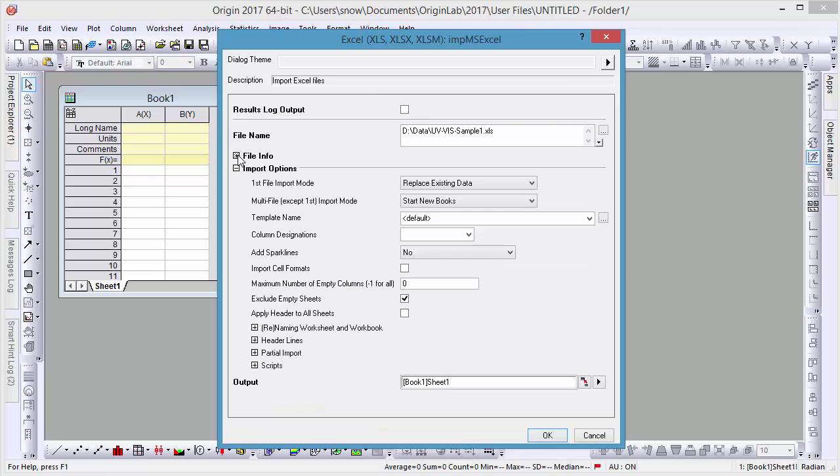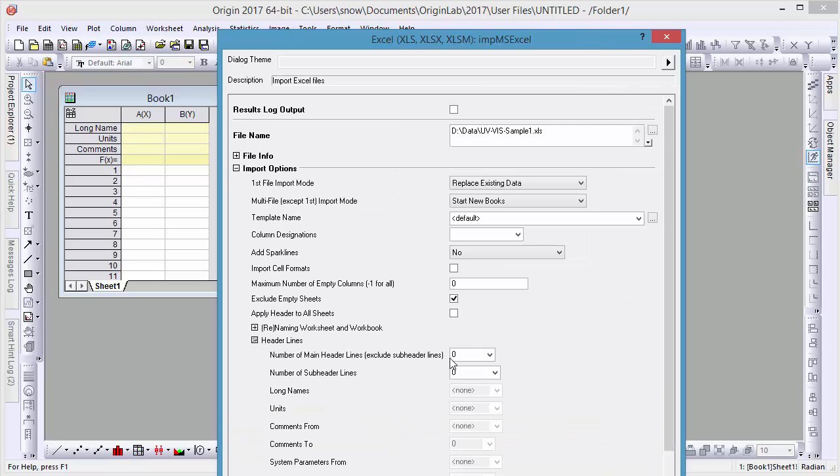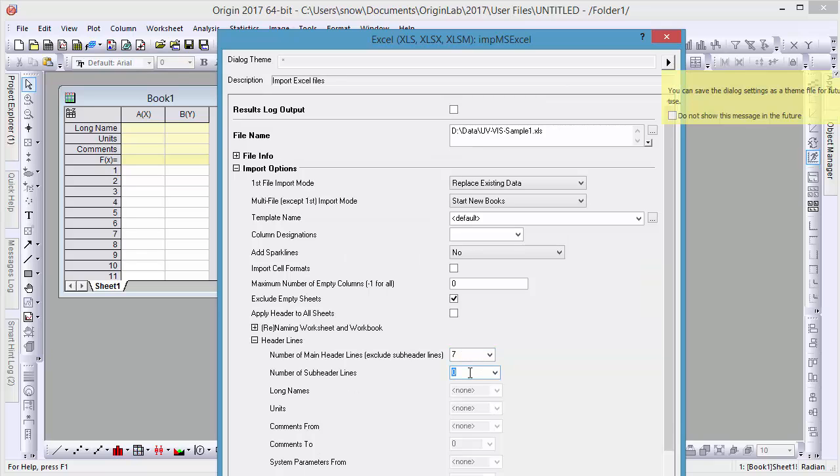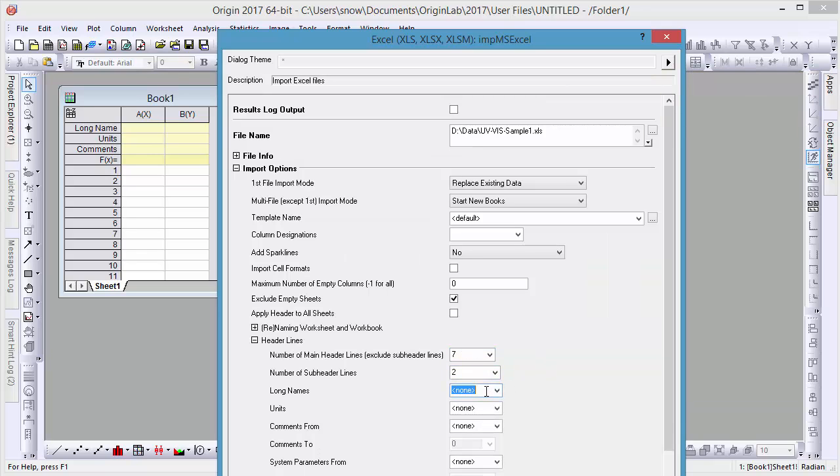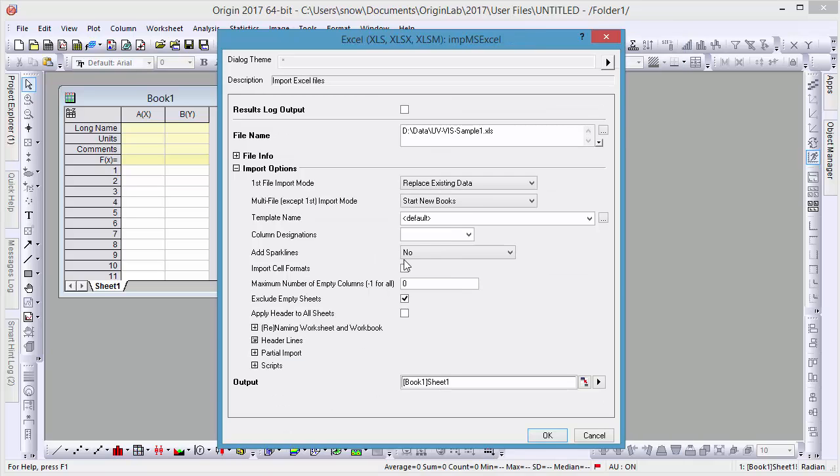In the Column Headers tab, you can specify how many rows of data cover the main header and subheader, and set them as the Long Name and Units. We can also turn on Sparklines to easily view trends in our data.